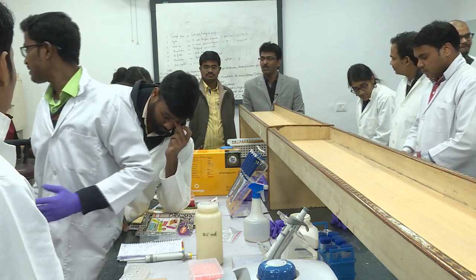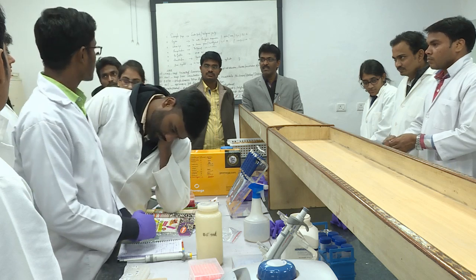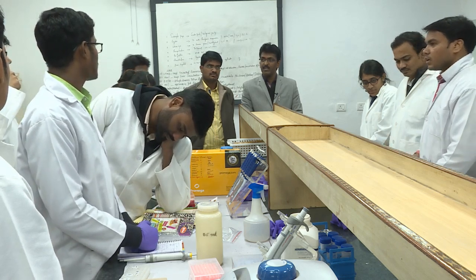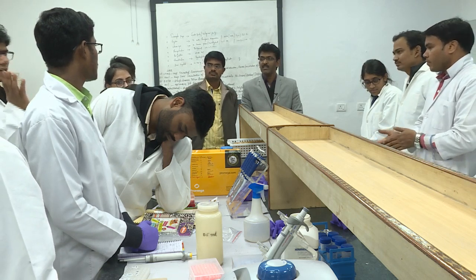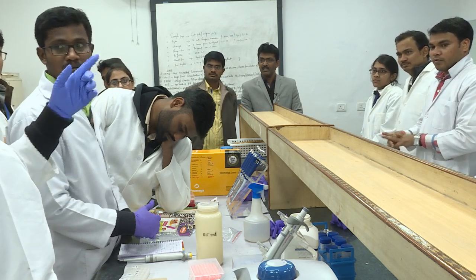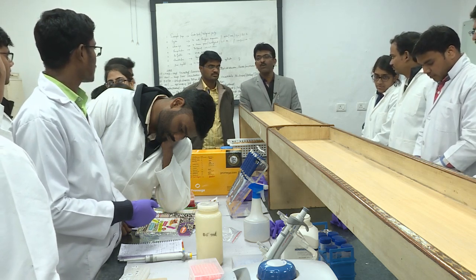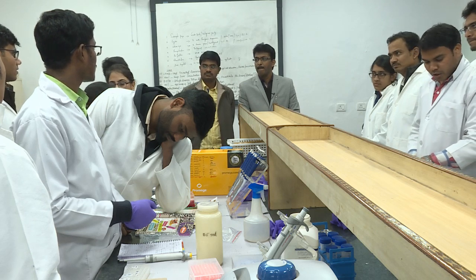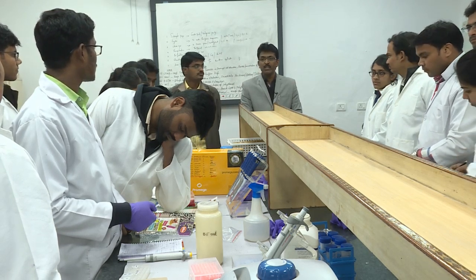So we need 3 PCR machines. What is our plan, Kuleshwar, for 3 PCR machines? Okay. All the 3 machines are available, right? Yeah, it's available. Now the 3 PCR machines are needed to do these 4. Now 2 only are available. One is already started. 2 more are there. One is in lab number 10.